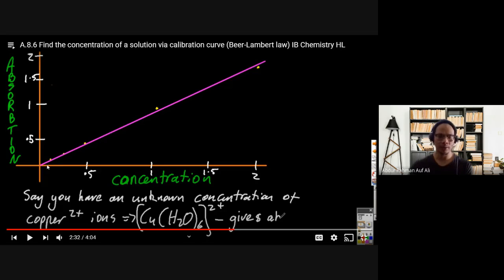Kalau kita plot graph dan dia bengkang-bengkok, dia melengkung naik ke atas, melengkung turun ke bawah, ataupun berterabur, so that means that the spectrophotometer instrument sudah bengong, dah tak betul, something needs to be fixed. Sama lah macam kereta, kalau kita buat speed test, RPM test pada dia, kita tukar minyak enjin, tukar minyak hitam, tukar minyak ATF, check balancing alignment semua, tapi dia still tak berfungsi dengan baik, that means something is wrong, kita kena check and repair.